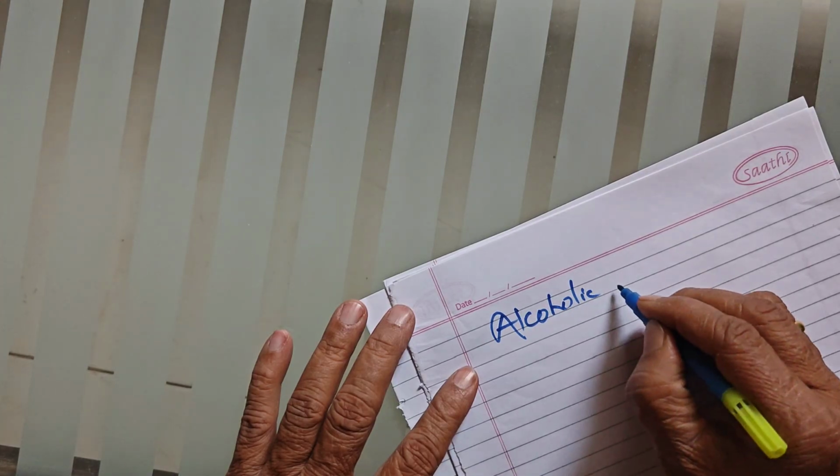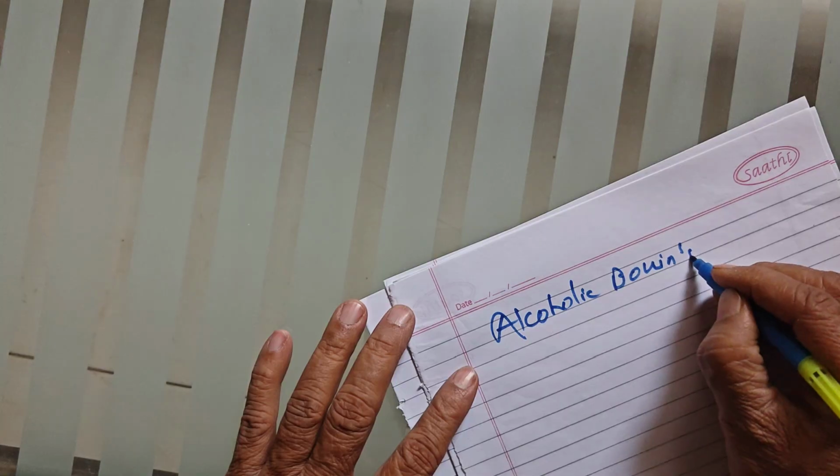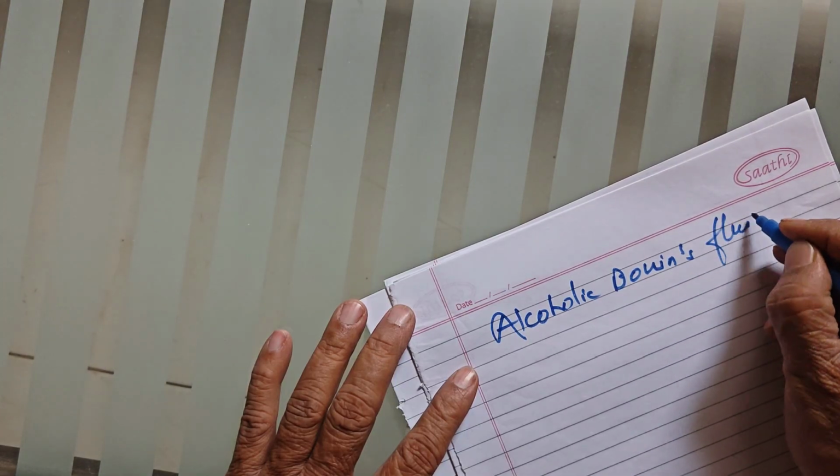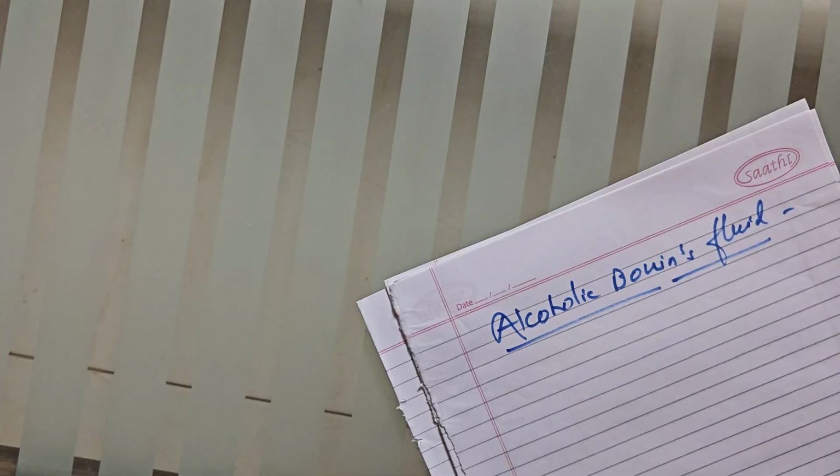Alcoholic Bouin's fluid. How can it be prepared?